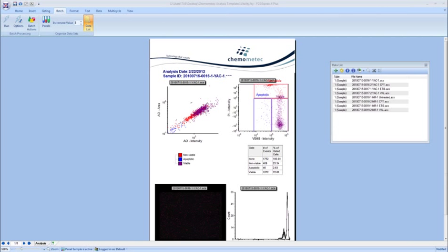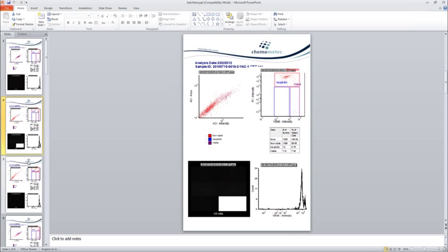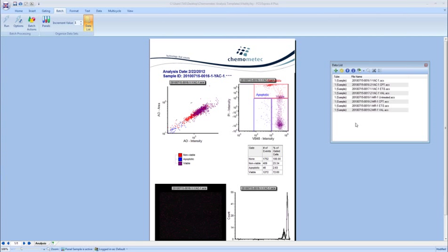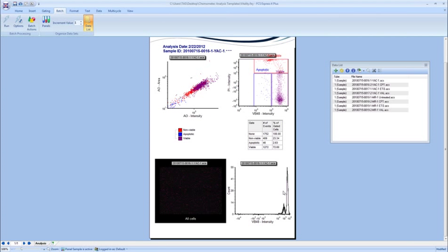On my PowerPoint screen here, I have my batch test, and let's see if I can bring this over. And you'll notice that we created 8 PowerPoint slides very quickly and very easily that are showing us all the data. So if you had 8 samples, or if you had 100 samples or 1,000 samples, all you would have to do is load them up into our data list, set up your batch process, click run, and then your analysis is done.